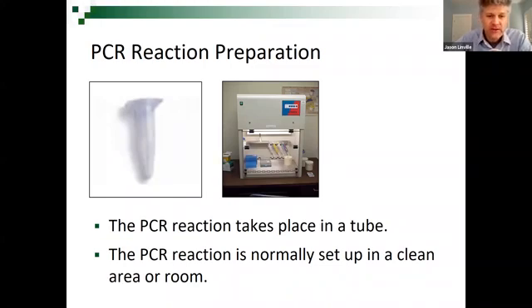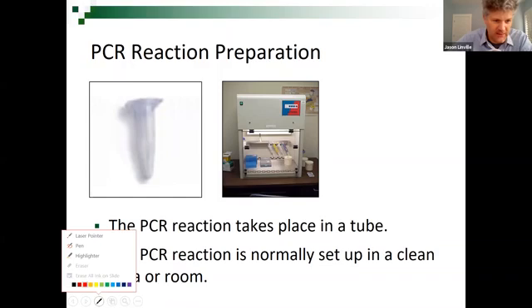Okay, our reaction is going to take place in a tube. So if we were actually to do this lab in class this semester, which unfortunately we're not going to be able to do, we would get out the 4 different reagents. Some of them would be mixed into the same tube, and we would just squirt all of the things into this tiny tube here.